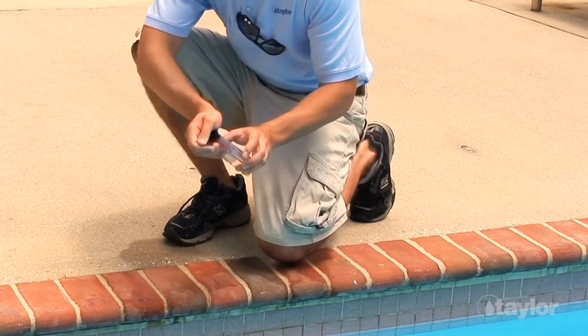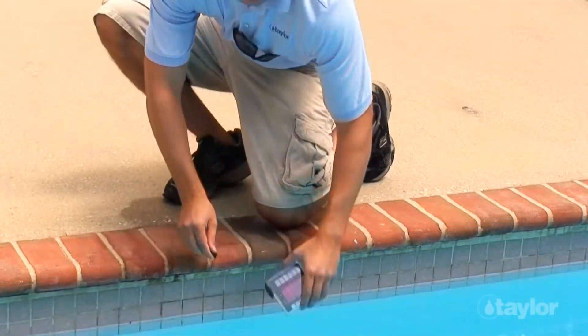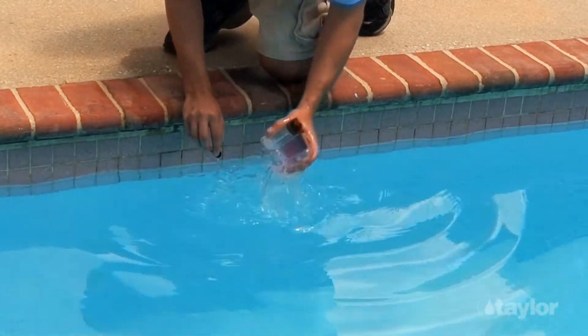Holding the comparator block, remove the cap from the test tube specified in the test instruction. Thoroughly rinse out the tube with the water to be tested.